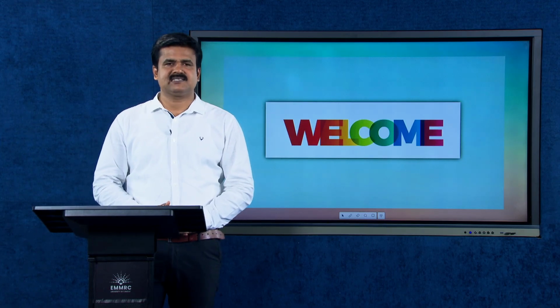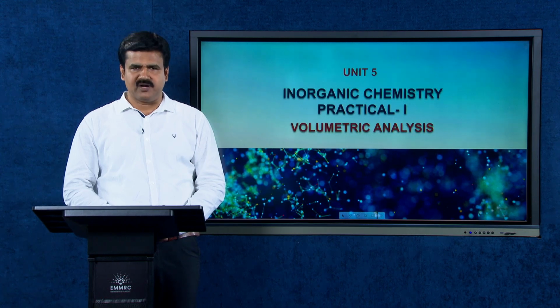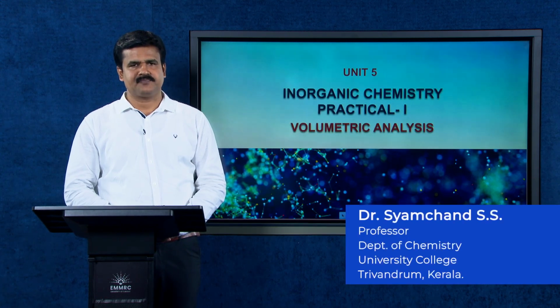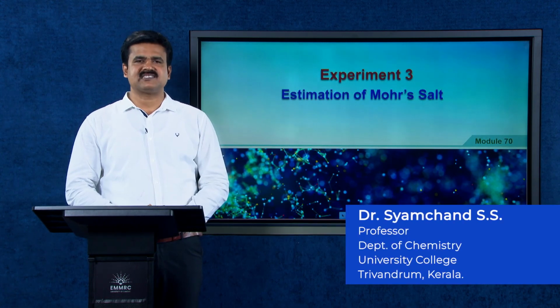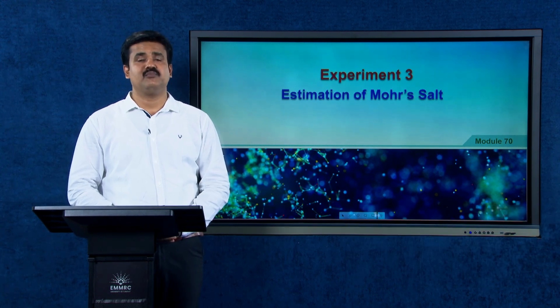Welcome dear learners. We are continuing Unit 5 Inorganic Chemistry Practicals 1 Volumetric Analysis. In this module we are discussing experiment number 3, Estimation of Mohr salt.